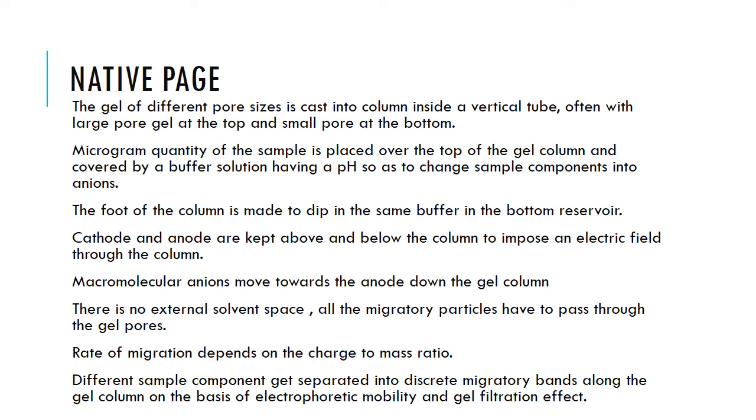So the rate of migration depends on the charge and mass ratio. The charge and mass ratio are very important when it comes to the movement of these particles.